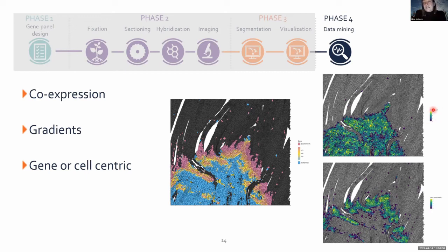And so you see in yellow, the cells that are highly expressing this gene, and in blue, the lowly expressing cells. In gray, there is no expression. So you see that here, this is knotted 1. We see that there is expression in the meristematic cells, but that the expression goes down towards the positions where the leaves are attached. We can do this gene per gene.